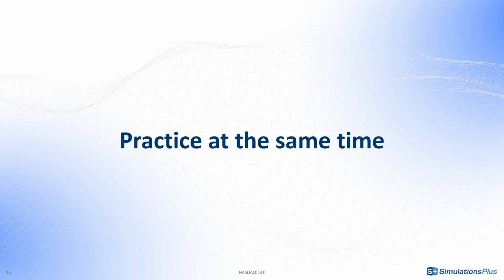Now I'm going to show you different examples of modifications of placeholders, but do not hesitate to try the examples with me. You can open a PKanalix project that you can download, as I mentioned, from the link in the video description, or you can open any project that you have and stop the video whenever you want and try to customize placeholders in the same way as I am going to do.